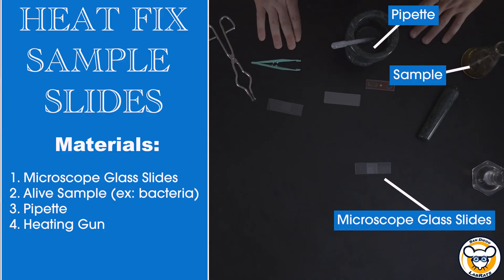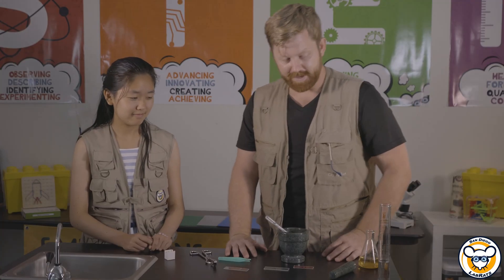Finally, we have the case of you working with something that's alive that maybe would be wriggling around, moving around underneath your slide. In this case, we took a sample from a leftover mug — I'm not going to tell you where it came from. Suffice it to say, you don't want to drink out of it. We mix that with some water as well, so very similar to the wet mount procedure.